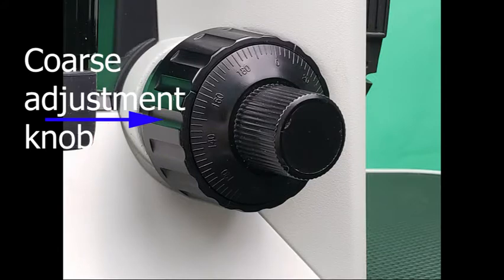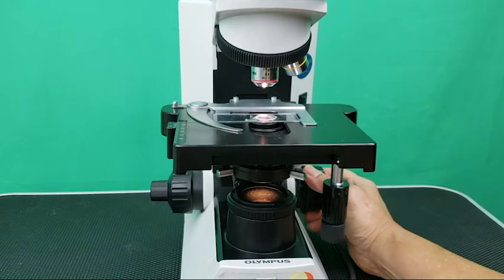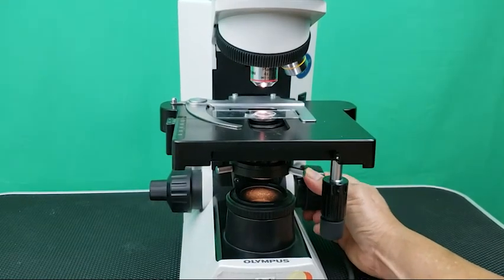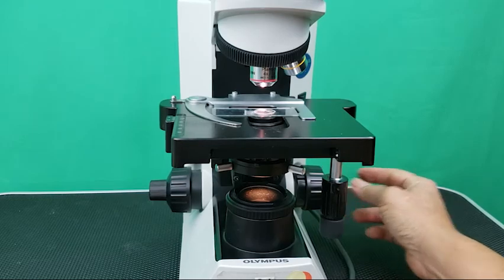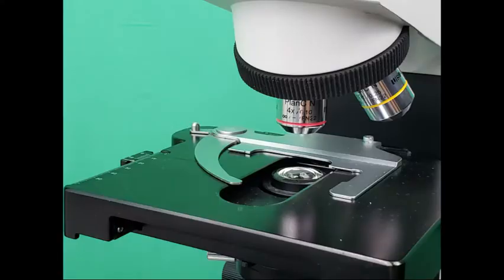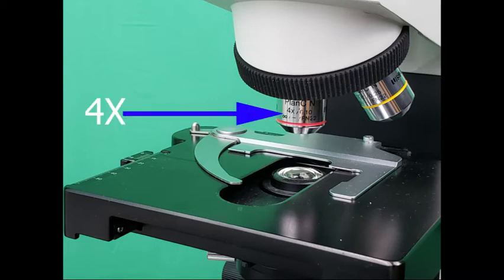Coarse adjustment knob: The larger knobs on either side of the base of the arm that allow preliminary focusing. Turning them produces relatively rapid movement of the stage, bringing it closer to or farther from the objective lens. The coarse adjustment knob should only be used with the scanning power of 4x in order to avoid contacting the objective lens with the microscope slide.